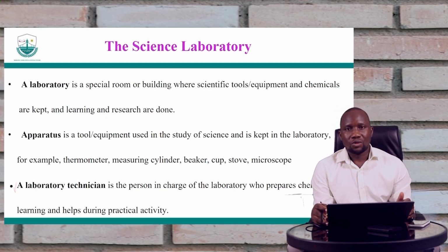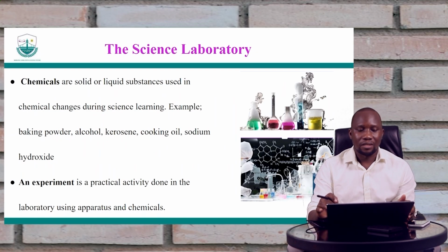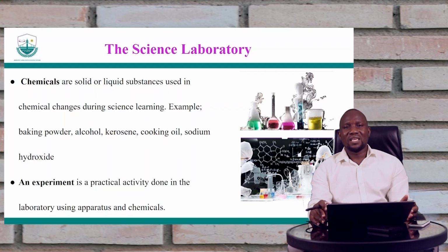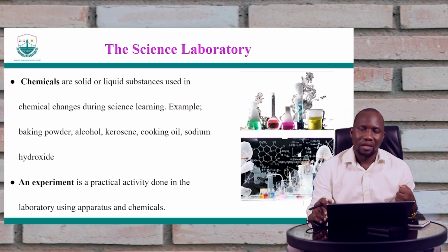So that means that you will need to cooperate with the technician so that you have a good experience within the lab. And then the chemicals: you will be mixing a number of chemicals, whether it is nitrates, sulfates, whatever, a lot of chemicals. So these are basically substances that you will be using for your experiments in the lab.